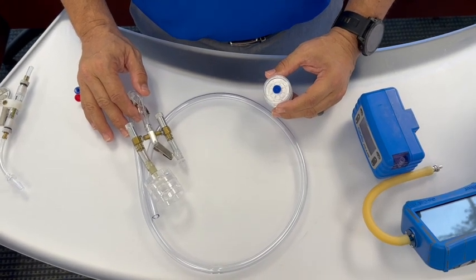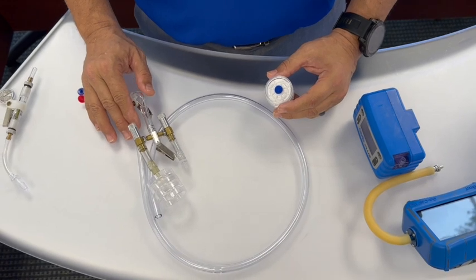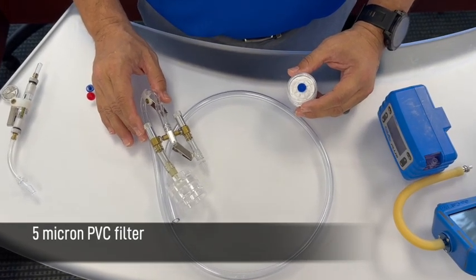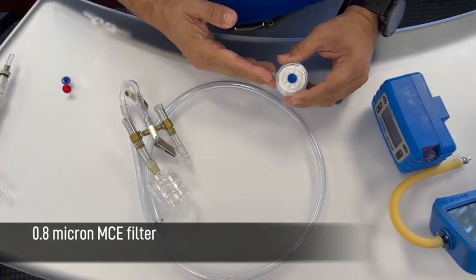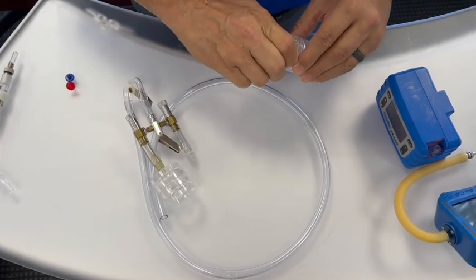Next we will connect the media to the intake side of the manifold. We'll be using a 5 micron PVC filter, typically utilized for welding fume sampling, as well as a 0.8 micron MCE filter utilized for sampling hexavalent chromium.